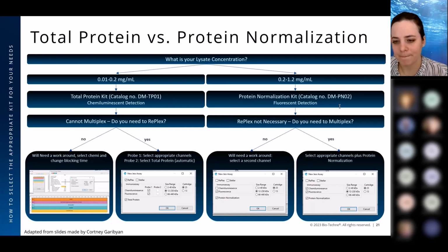Yes. So if I'm understanding it correctly, is there any chance that you have an overexpressed protein that's being picked up by Not really. No, not really. We do nothing with overexpressed proteins, and these peaks differ in the same lysates between the targets or target proteins.